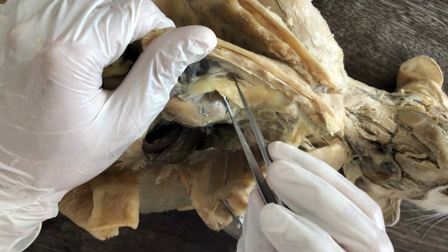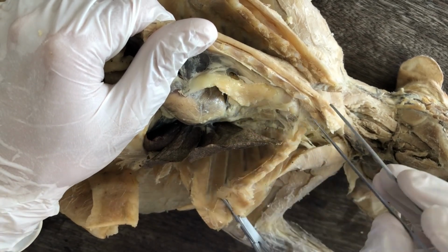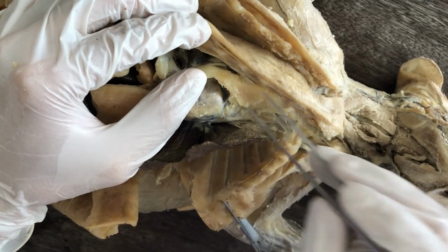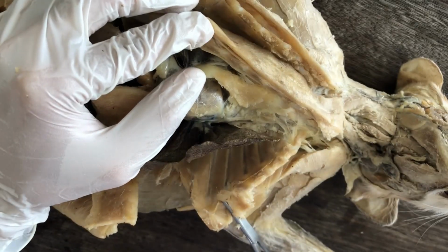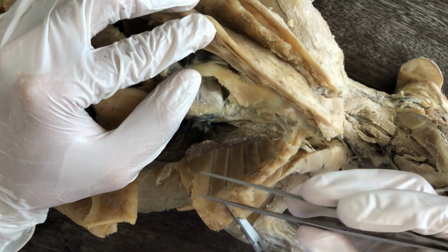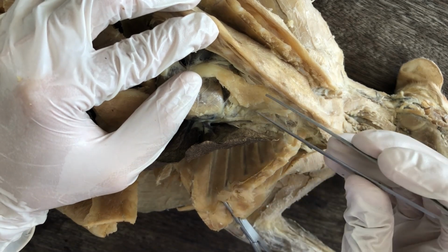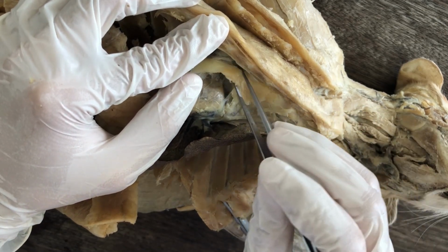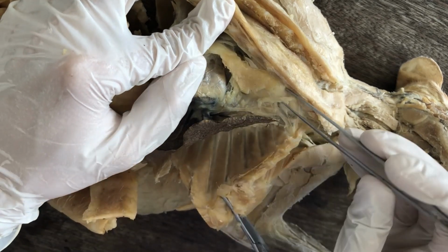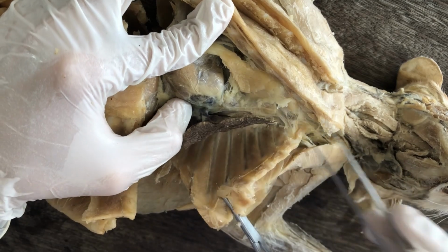The thymus gland is the site where the T cells mature. And as the cat matures, apparently, the thymus gland becomes replaced by fatty tissue. It undergoes fatty degeneration. And so maybe in some of our cat specimens, you won't be able to see an intact thymus gland if your cat specimen is old. Right? But in this case, it's intact still. This is the thymus gland, ventral to the heart.